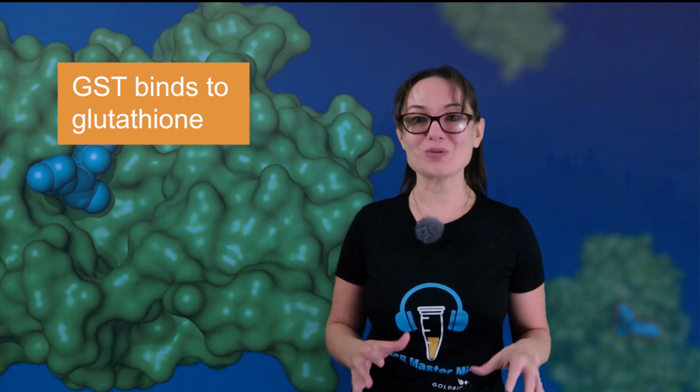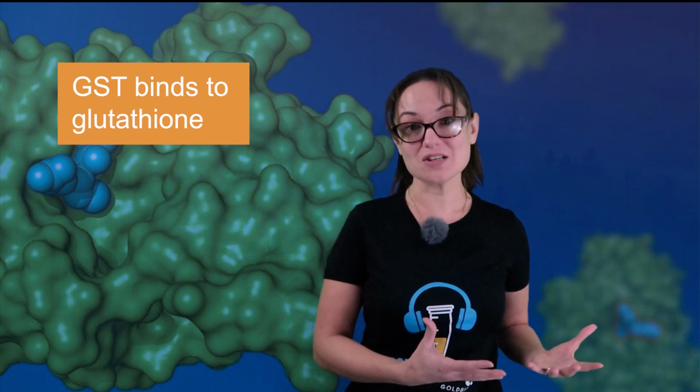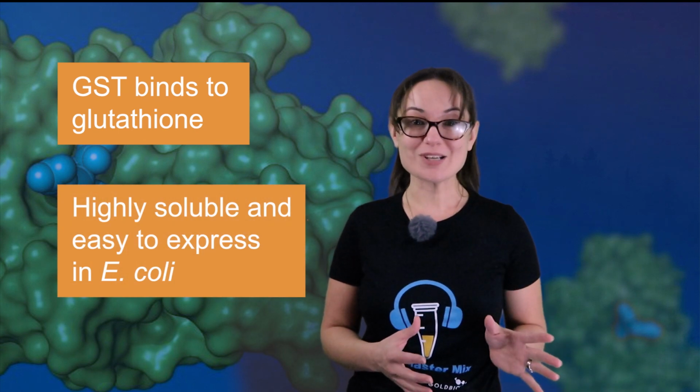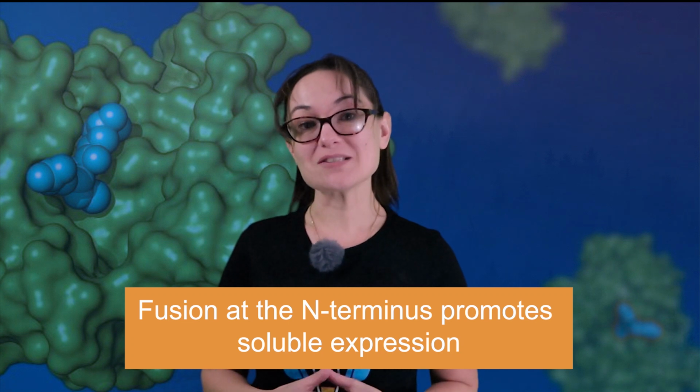All right, so first up we have GST tags, or Glutathione S-Transferase tags. These are one of the most popular solubility tags. GST binds to glutathione, which is used for affinity purification and downstream applications like GST pull-downs. GST is known for being really soluble and easy to express in E. coli. When added to the N-terminus of your protein, GST often helps it stay soluble.